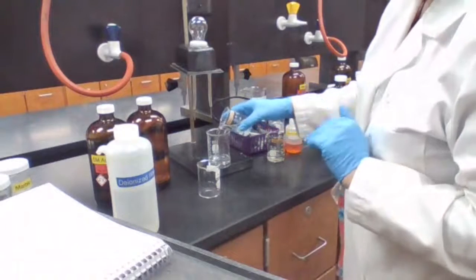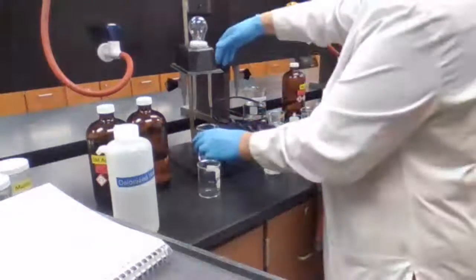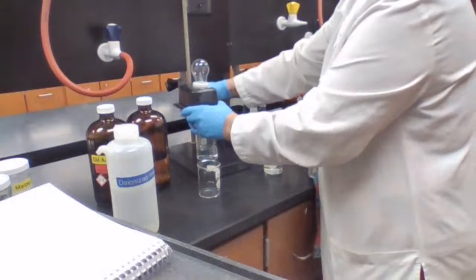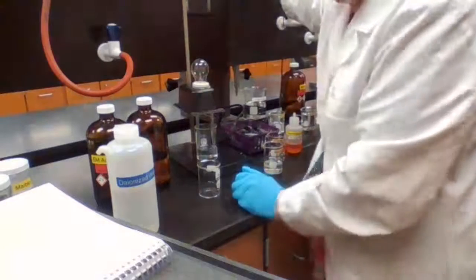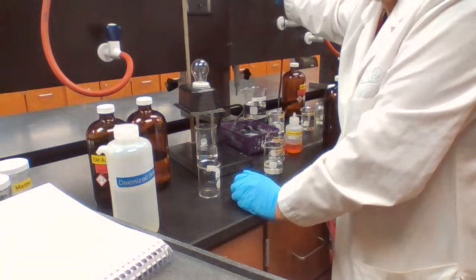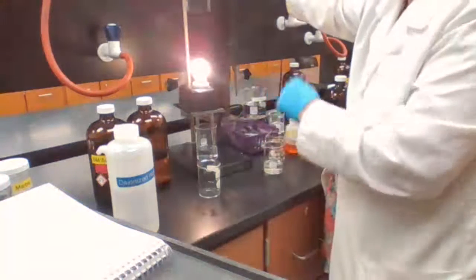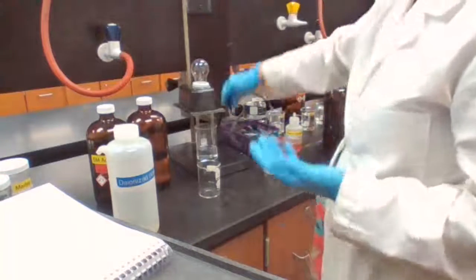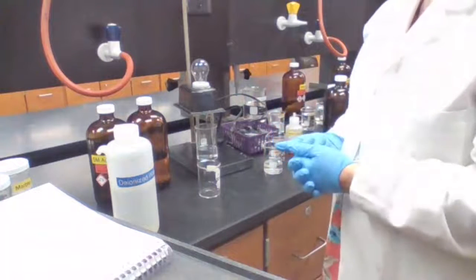You already know both of them are strong electrolytes as separate compounds. When we mix them, what are the products? The products are water, which is not an electrolyte, but also salt, NaCl. NaCl in water is going to be a strong electrolyte. So we have products that are also electrolytes. This is one of the examples that I said: sometimes reactants are electrolytes and products also are electrolytes.